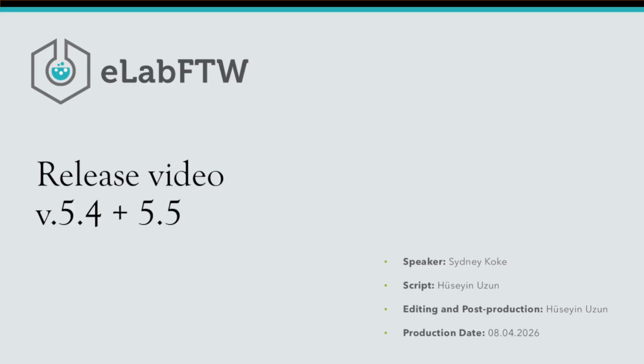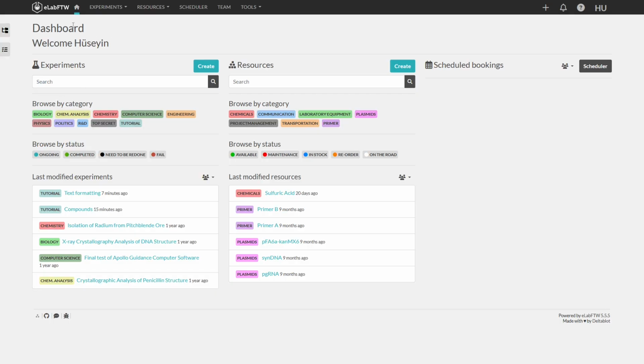Welcome to our eLabFTW release video. In this video, we will show you the most important new features and improvements in versions 5.4 and 5.5. Let's get started. We are now on the eLabFTW dashboard.